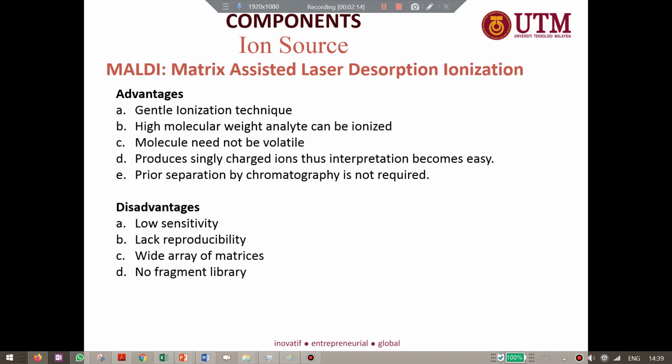so just a small amount of analyte could be desorbed and detected as ions. Okay, and lack of reproducibility. We are not really sure if at the same spot our analyte is totally homogeneous or not, and we are not really sure the conditions are the same.